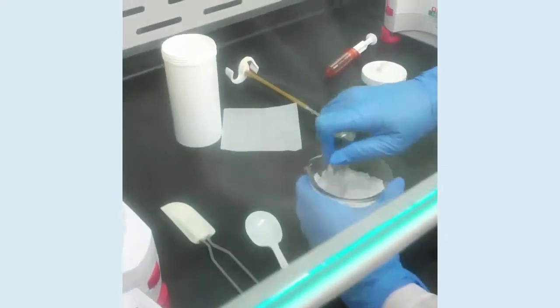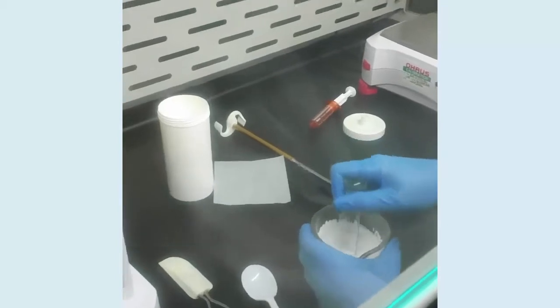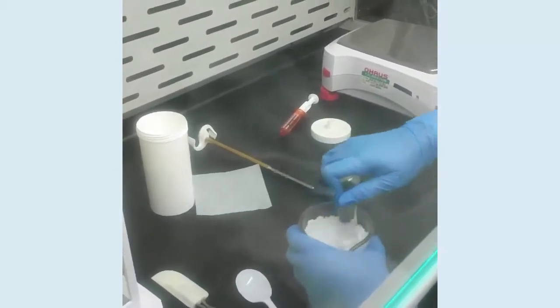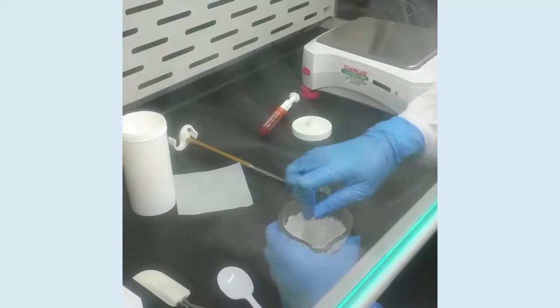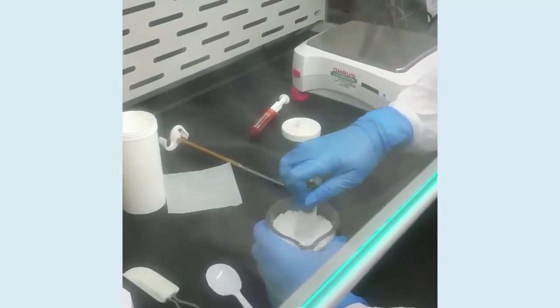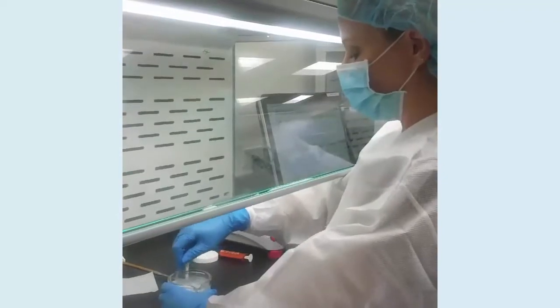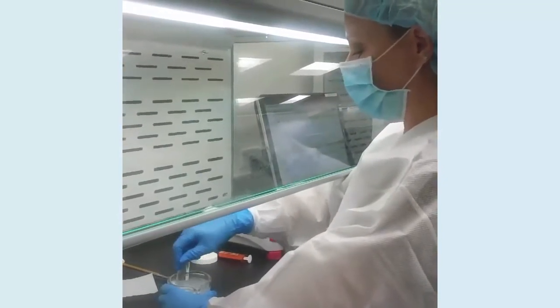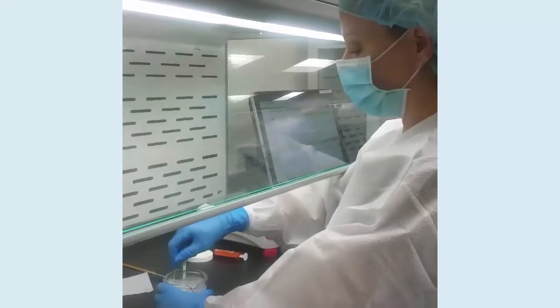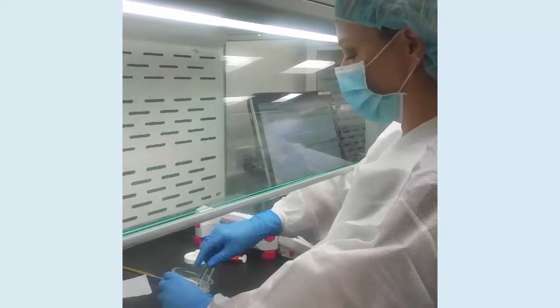Then we'll spin it on our ungulator to make sure all the active blends thoroughly into the cream base. We have a cream base or a gel base depending on what gender you are. Depending on what you're losing, you can combine a multitude of hormones all in one cream if you'd like.